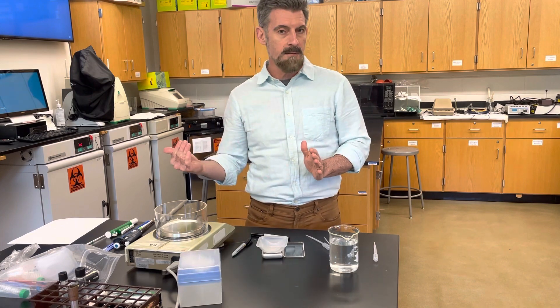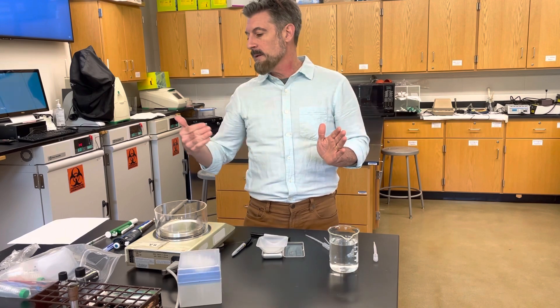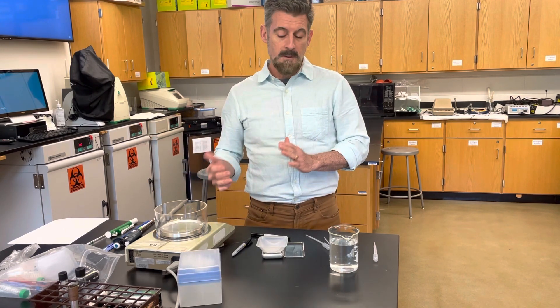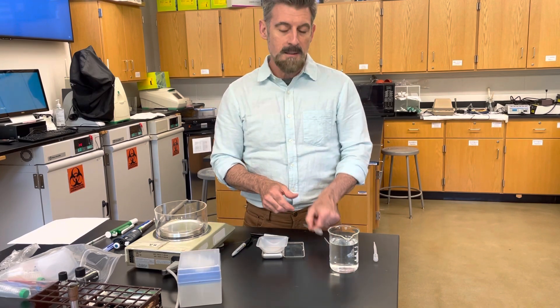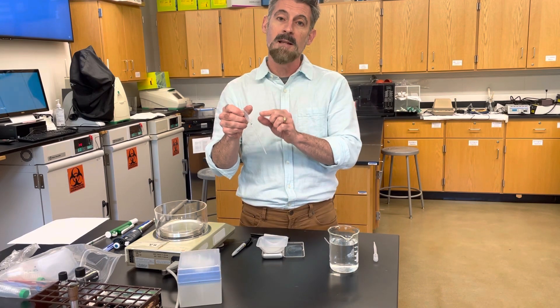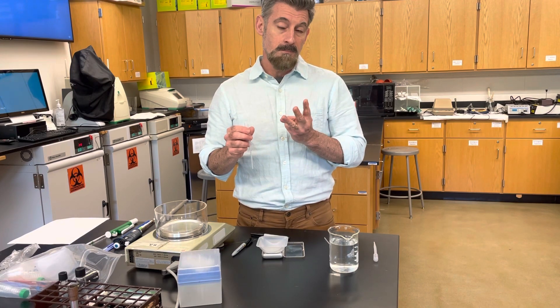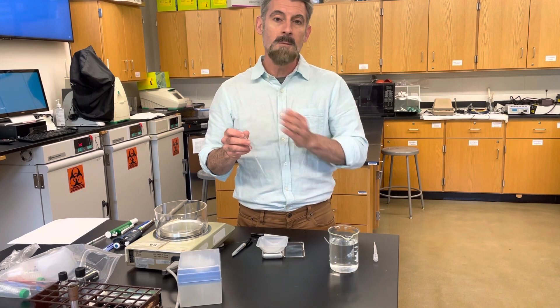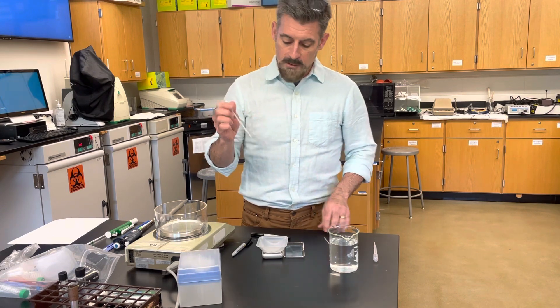So now what we're going to do is the actual pipetting lab. I'm going to go through a good piece of it and the data that you're going to collect and the calculations. You're going to repeat this multiple times with different volumes. You need your balance, some water, the weigh boat, and the pipettes that you've already calibrated — with markings at one mil, half a mil, and three milliliters.